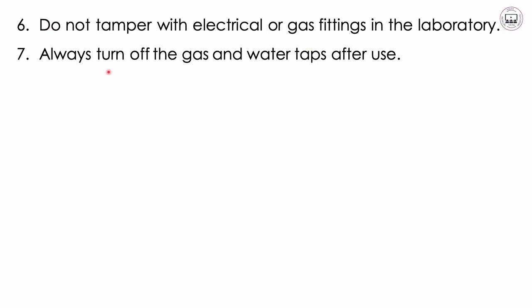7, always turn off the gas and water taps after use. After use, you turn them off because you may leave the taps running whereby the water is of no use at that time, then that is just wastage. So close or turn off the gas and water taps after use.